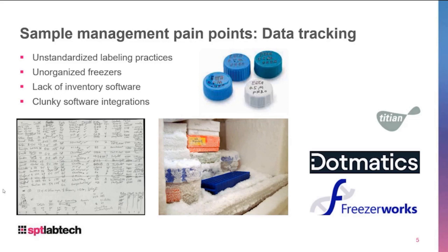We at SPT Labtech work with all of them. We're fairly software agnostic, but we do have some that we've developed some more personal relationships with, some quicker driver design, that sort of thing. But one thing to note on the clunky software integrations point here is that ultimately the transition into a software product is not the most smooth.